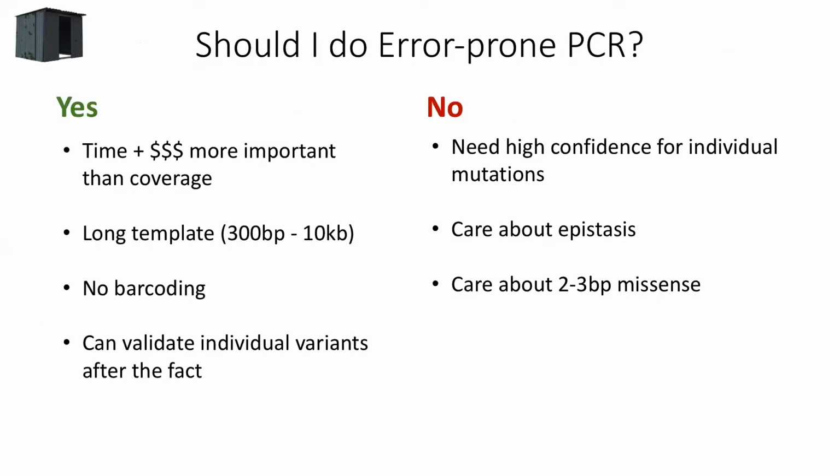So, should I be doing error-prone PCR? In many cases, the answer is yes, especially if the time and money of the library construction is more important to you than totally maximizing your coverage. In particular, it's also very amenable for long templates. And I would say, in general, it's nice if you're thinking, I don't want to barcode this library.